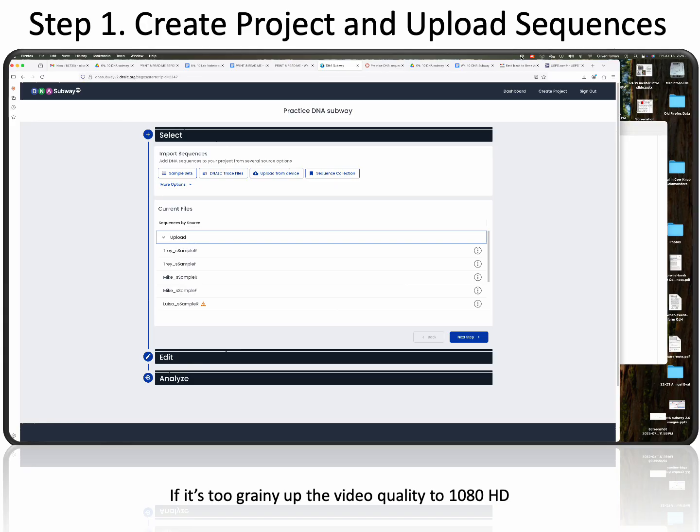So we'll be using a practice set of fungal DNA sequences for this video's activity, but of course we'll use the same method to upload all of your group samples when you do this in lab in the coming weeks. Make sure that you download all the forward and reverse sequences for each of your samples. So if you have 4 samples in your group, it'll be 8 total files.